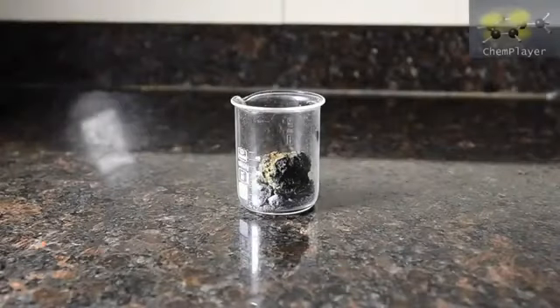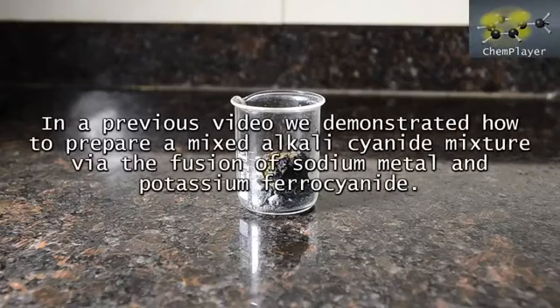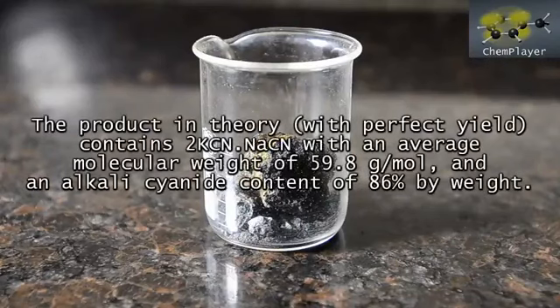Today we're going to do an experiment with alkali cyanides. We showed you our preferential way of producing these in one of our first ever videos, using sodium metal and anhydrous potassium ferrocyanide. What you end up with is a fused mass like this, which contains a combination of metallic iron and a mixed sodium and potassium cyanide salt.